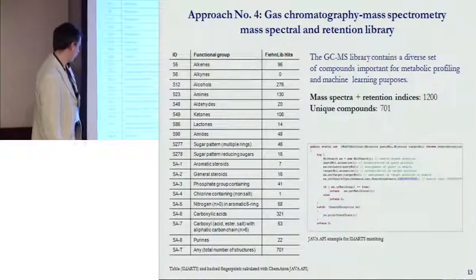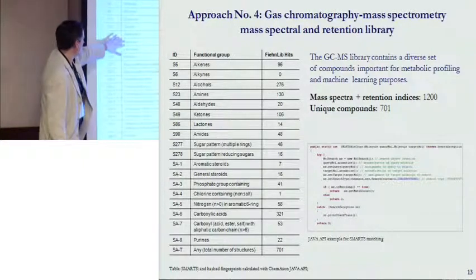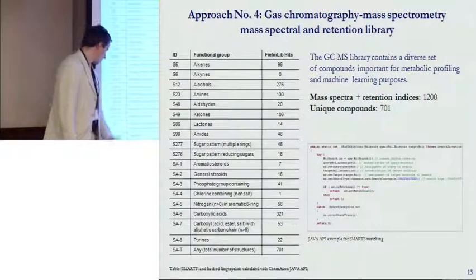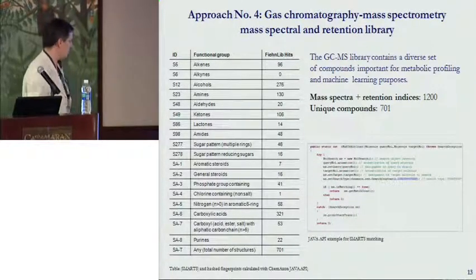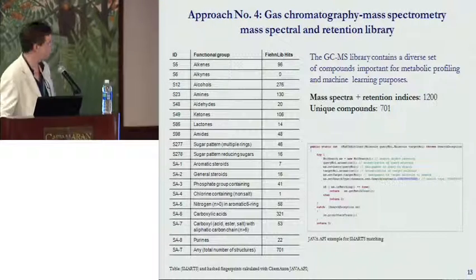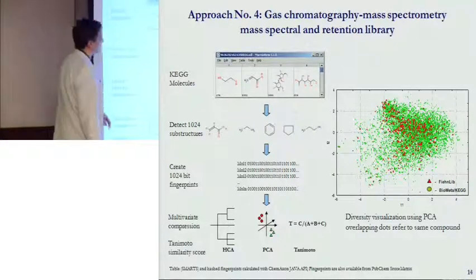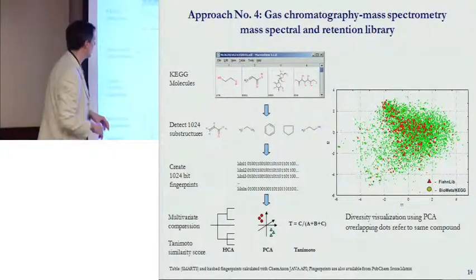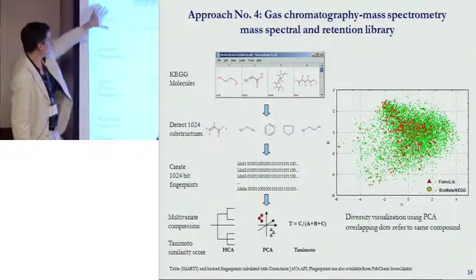So we had a list of SMARTS to distinguish what kinds of alkenes, amines, aldehydes, ketones, and so on we have in our database. I think we got the SMARTS table from a public open source, and we used the ChemAxon API for creating this table of components. And in a second step, in order to figure out database overlaps not only by the numbers but by visualization, we can take, for instance, these metabolites which are in the KEGG database, in the metabolite database.